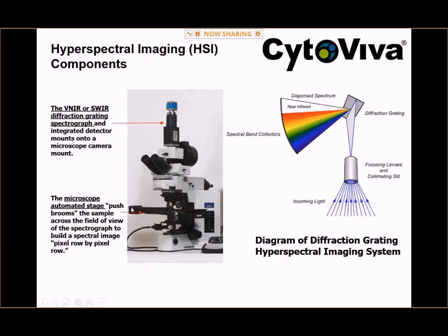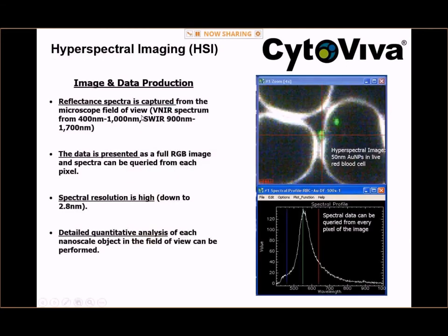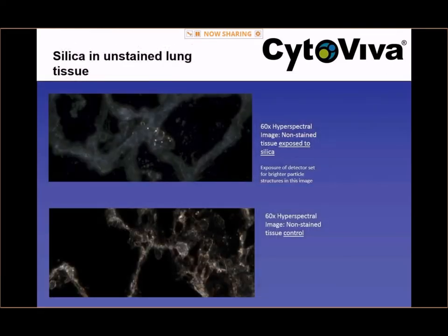The spectra data can be gathered in the examples Leslie provided in just minutes. We can capture in the VIS-near-infrared all of the spectrum in every pixel from 400 to 1000 nanometers, and in the short-wave infrared from 900 to 1700 nanometers. The data gives you a full RGB image and the spectra is queried in every pixel at very high spectral resolution, so that detailed quantitative analysis can be illustrated.